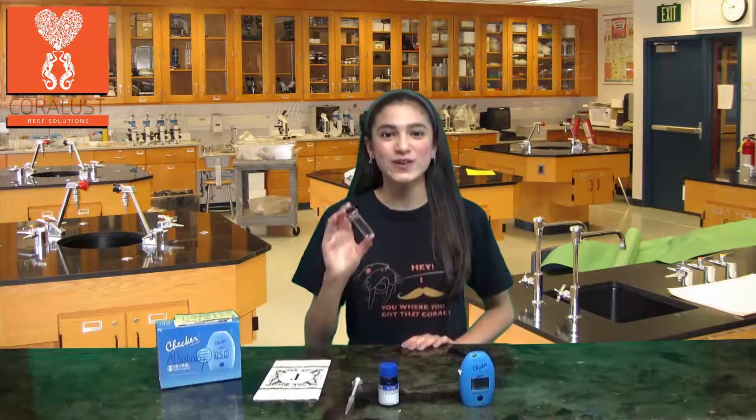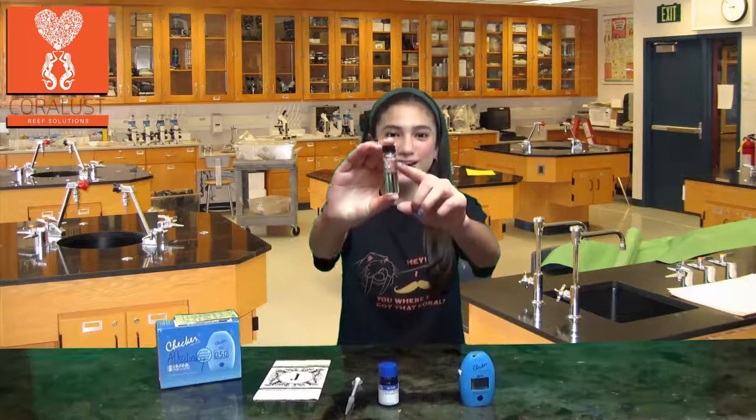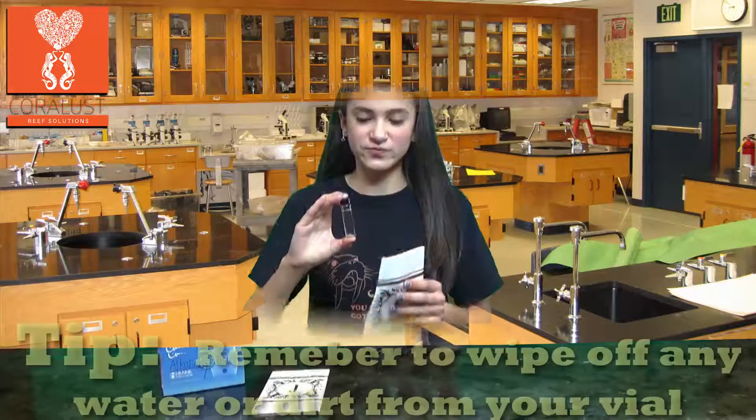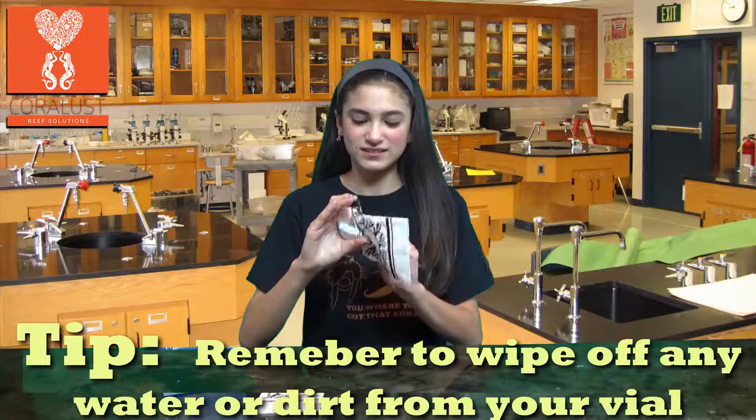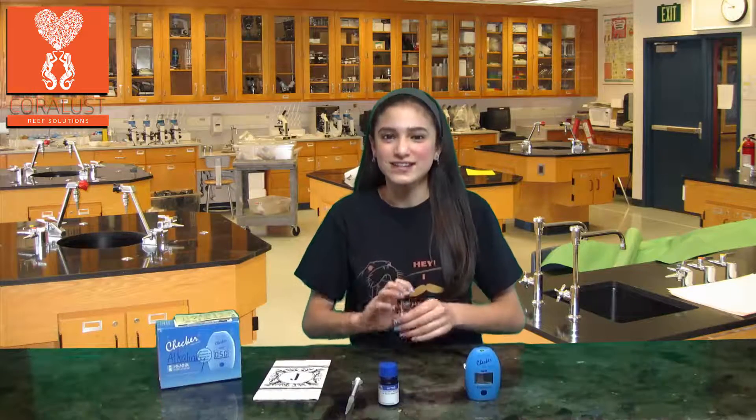Make sure you rinse out your vial with your tank's water before refilling it to the 10ml mark. Now you are ready to use the checker.